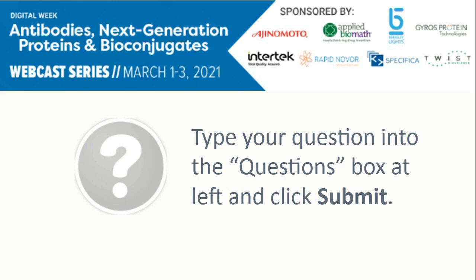So we have highly inbred strains that might produce a more convergent antibody response. This might be better for us with respect to the sequencing workflow, but of course we're happy to talk about it with you and run through the thought experiment before we try anything as well. Yep.